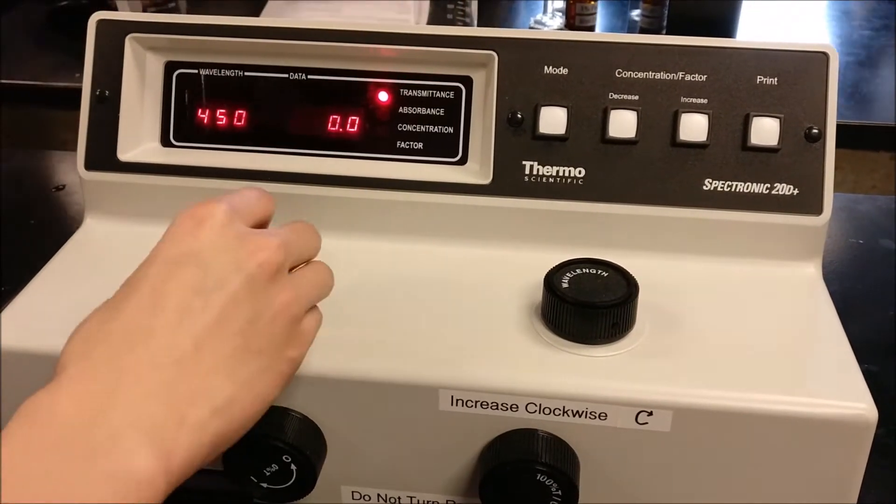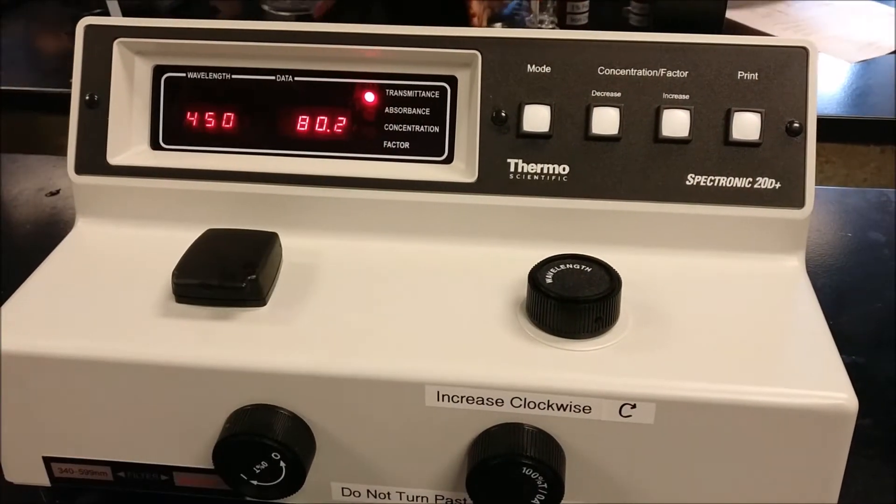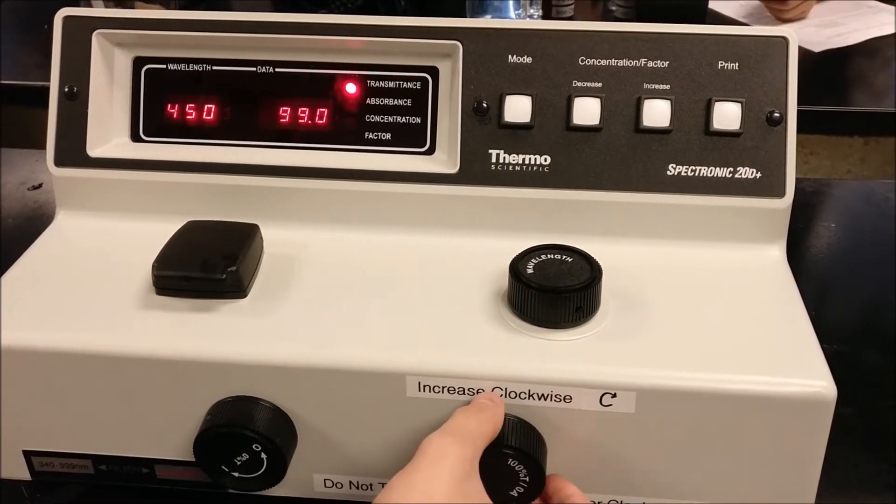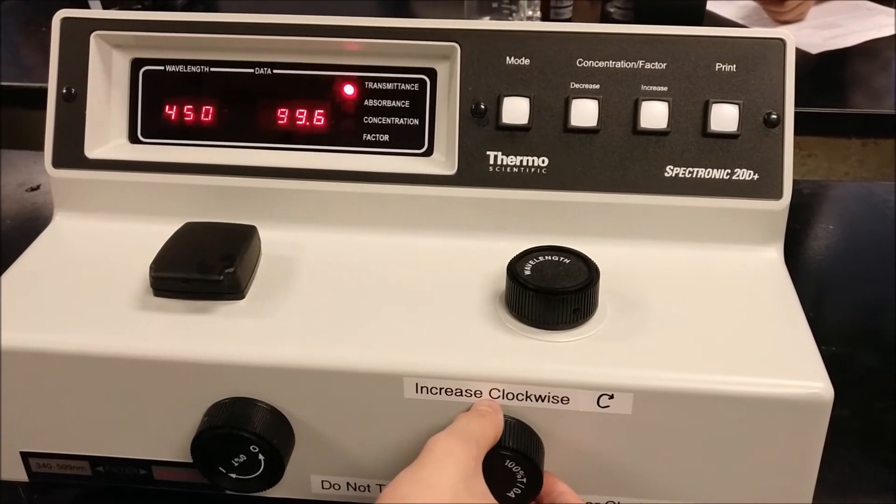Fill the test tube with water and put it into the sample holder. Make sure the white label on the test tube faces you when you put the test tube in. When the reading remains stable, adjust the transmittance to 100 by adjusting the 100% T knob on the bottom right.